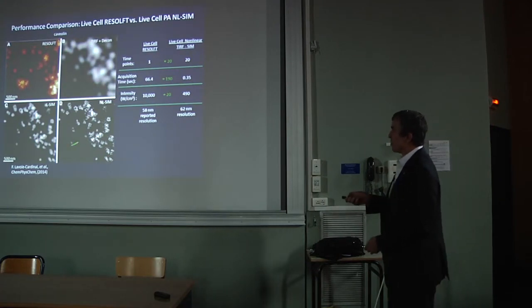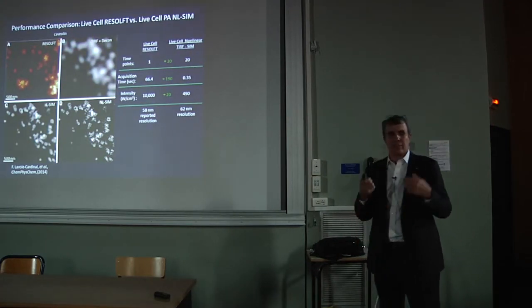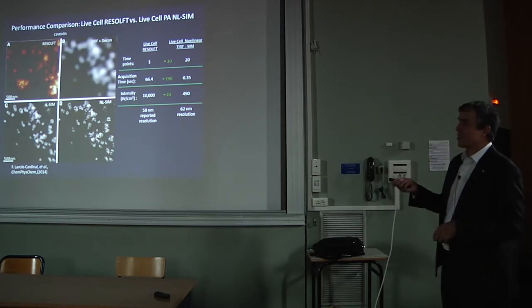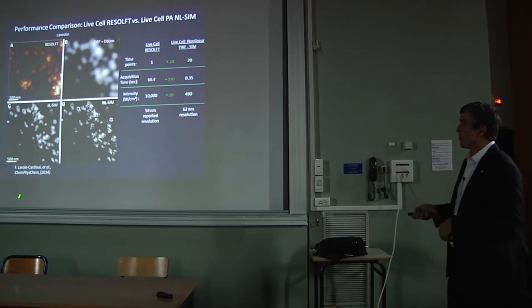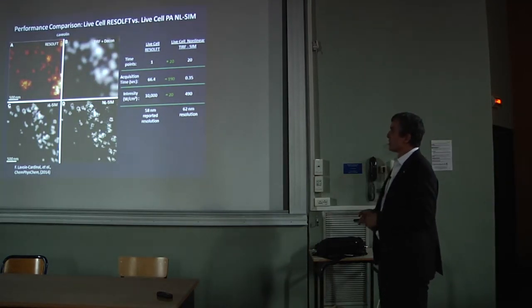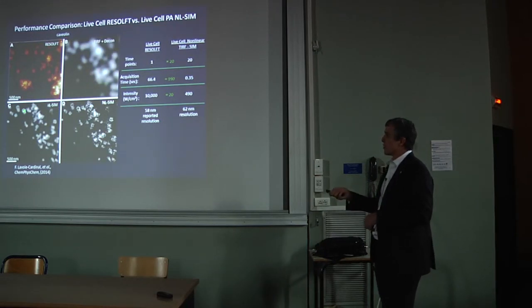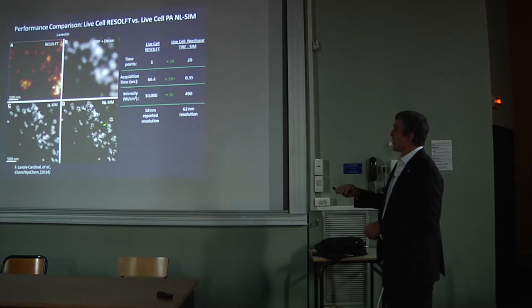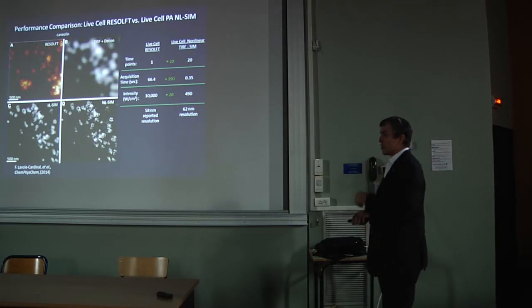So one final comparison then is we can compare that to the RESOLFT technique I've been mentioning that Stefan Hell developed, because he had a paper last year where he looked at caveolae. So here's the image of caveolae there. Here's the diffraction limited image that we get. Here's the linear SIM, which is clearly better already, even at the 100 nanometer level. And then here's what we get with the nonlinear SIM.